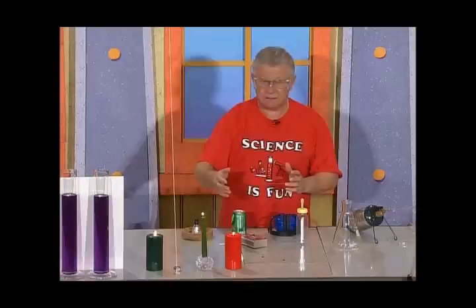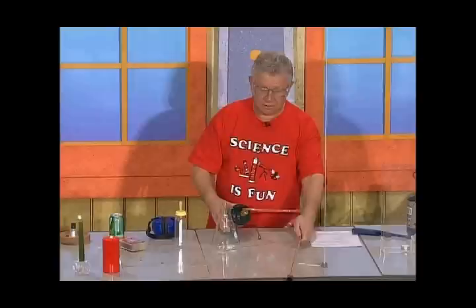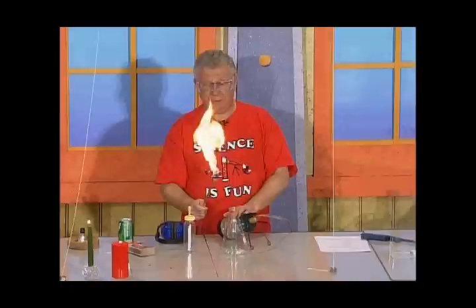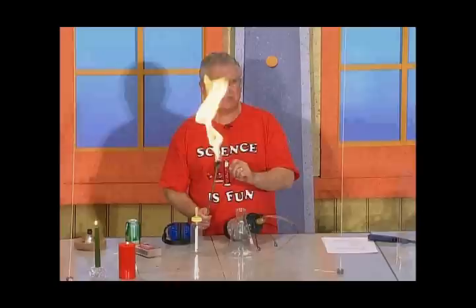These are examples of what we call controlled combustion reactions. I have a propane tank right here, and I'm going to open it up. It's connected to this long wand, and there it is. Got your attention, right? This is also an example of a controlled combustion reaction. It's a beautiful yellow-orange flame. At the bottom of the flame, in fact at the bottom of almost all flames, there's a nice blue tinge. I want you to think about that. Why is there a blue tinge at the bottom of all flames?